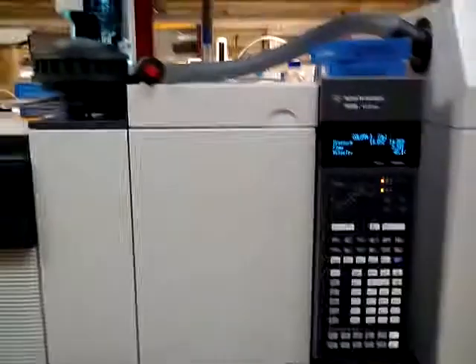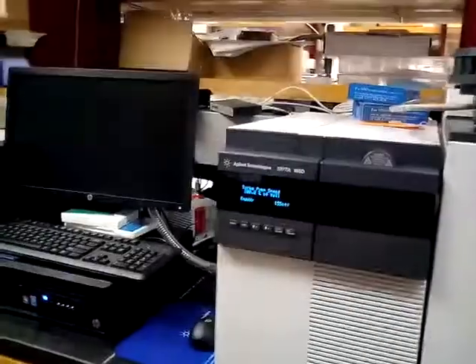More gas. Okay. And a gas chromatograph. GC. GC-MS. HS, headspace sampler. HS, GC, MS. Ooh. Okay, another printer. All right, do one more little lap. All right.